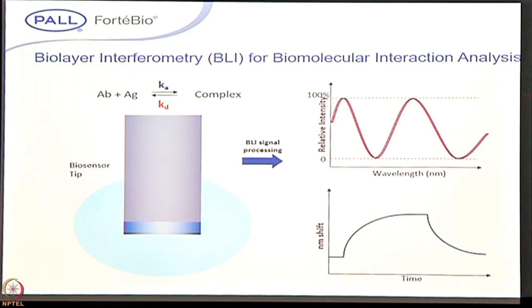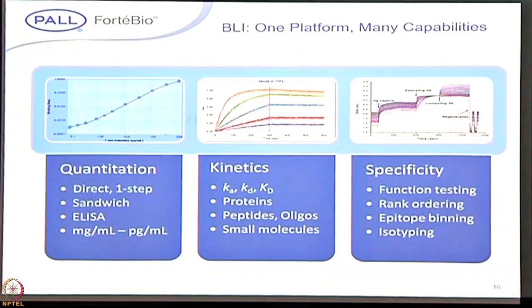The background is this: the molecules bind to the sensor surface, make a biolayer and cause a relative shift, and once you wash off, it comes back. So what information can you get from this?